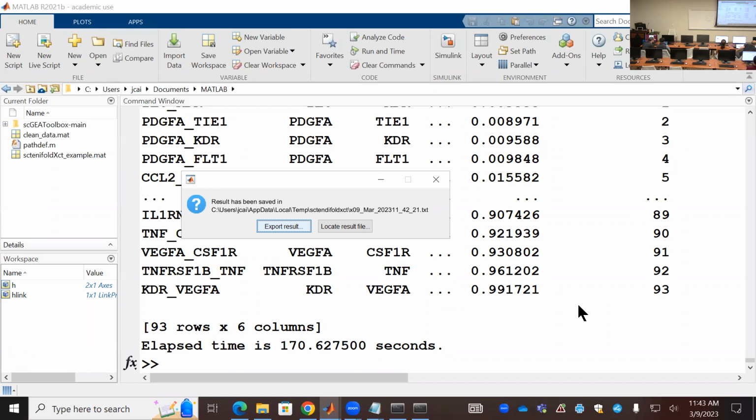You haven't installed this package from here. If I do Python, this is the correct version.